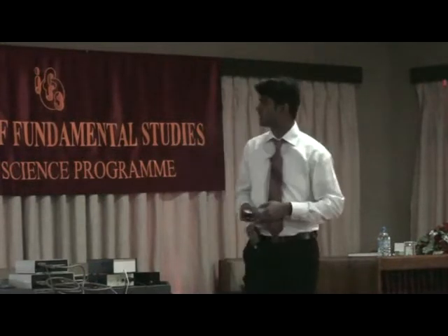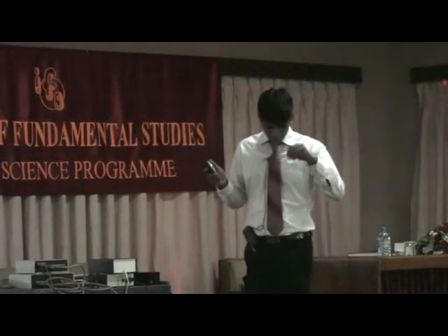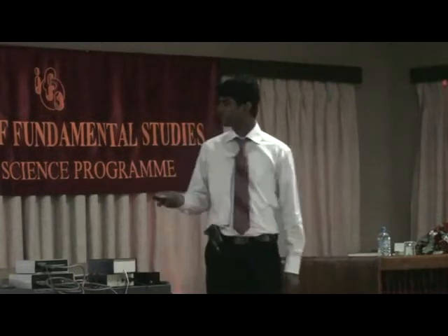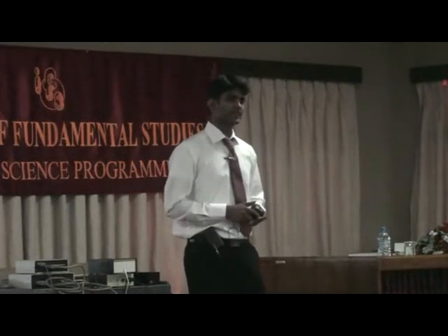We cannot move atoms, but we can see up to a certain level at the atomic scale using this scanning electron microscope, right? Do you have any idea how this scanning electron microscope makes images?